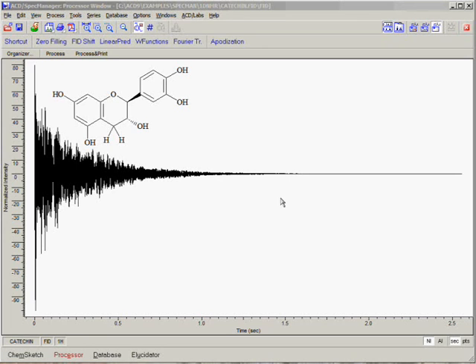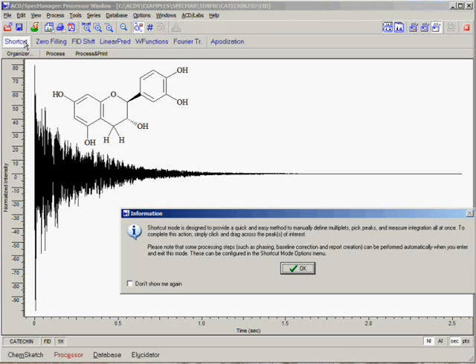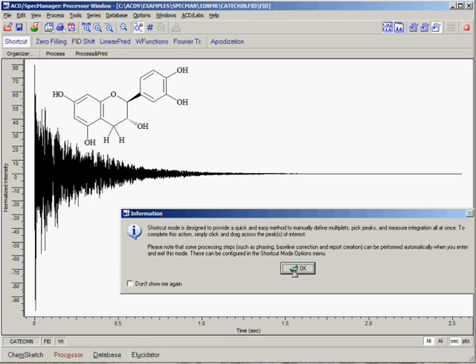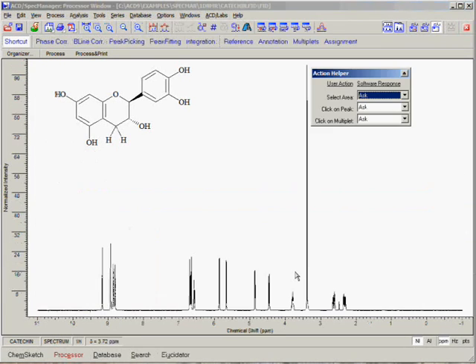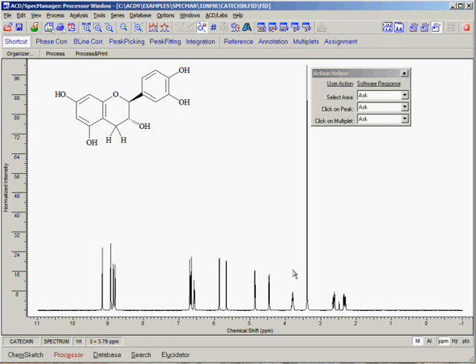To enter Shortcut Mode, click the Shortcut button on the Operation toolbar. We see a dialog box appear that explains what Shortcut Mode is for. After clicking OK on this prompt, we can see that several processing steps have been completed automatically to save time.